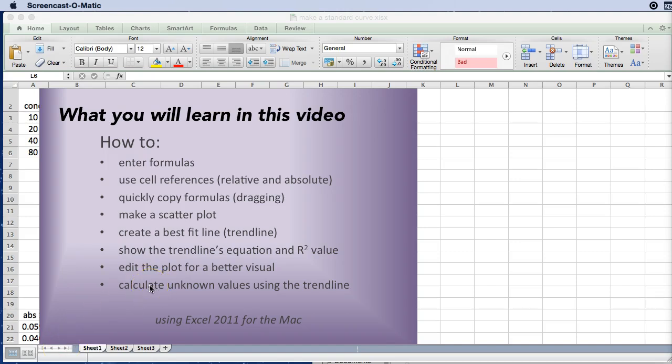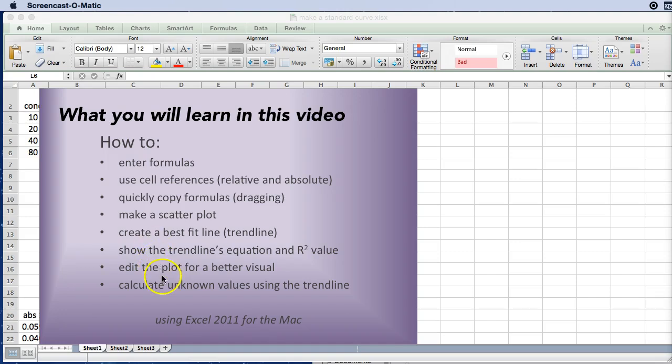More specifically you're going to learn how to enter formulas, use cell references both relative and absolute, quickly copy formulas, make a scatter plot, create a best fit line which is called a trend line in Excel, show the trend lines equation and r squared value, edit the plot for better visual, and finally calculate the unknown values using the trend line.